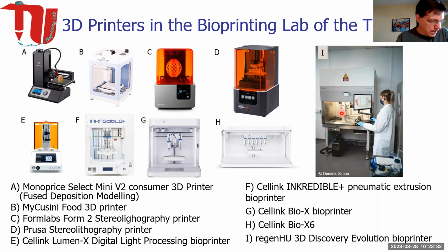Here you have 2 stereolithography printers. This one is a simple consumer printer, which we basically use for lab courses. And this is my favorite printer because this one prints chocolate.